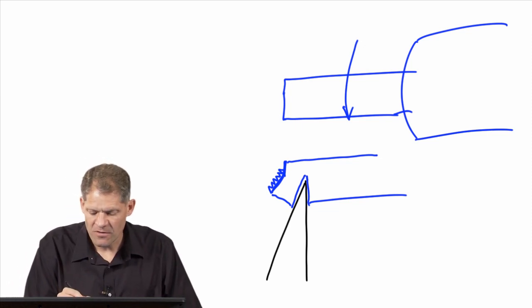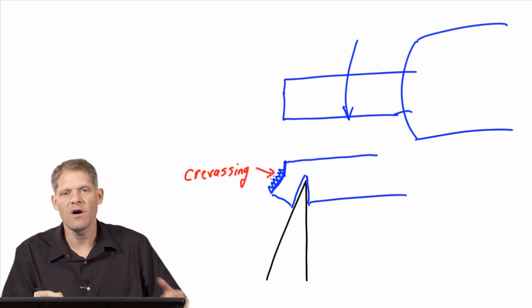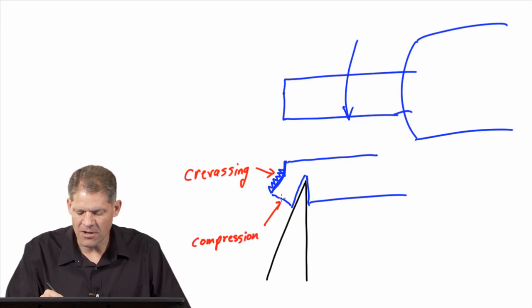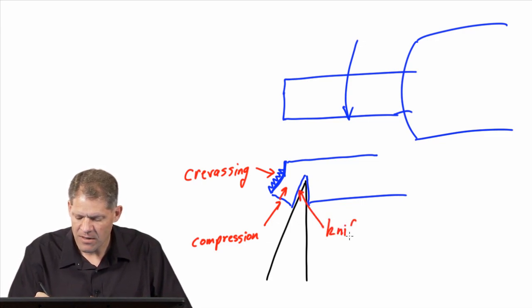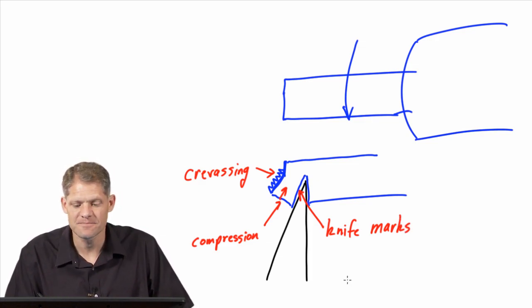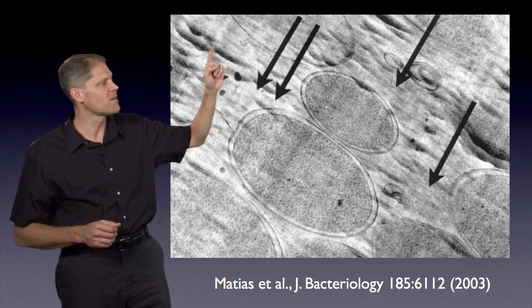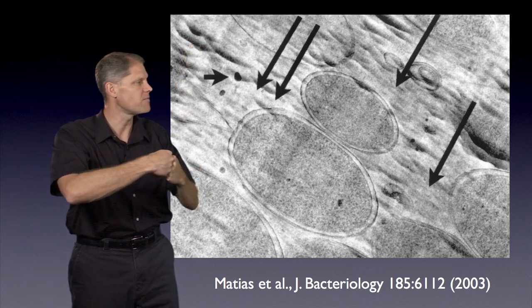So cryosections suffer from crevassing on the surface opposite of the diamond knife. They suffer from compression as they slide into the blade. It compresses the material in this direction. And finally, there are knife marks that arise as the knife scrapes through and cuts the frozen block. So you see these shadows that appear going across the section. These are crevasses that were caused by the outside surface being crushed on top of itself.